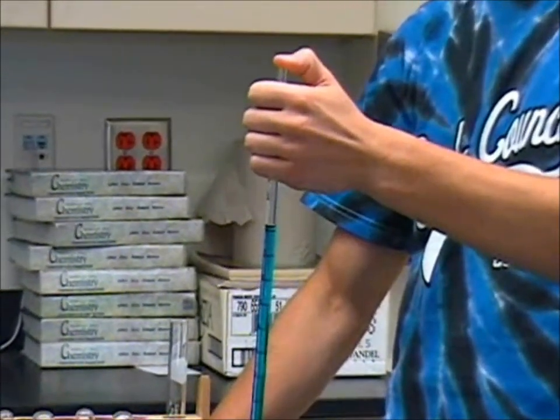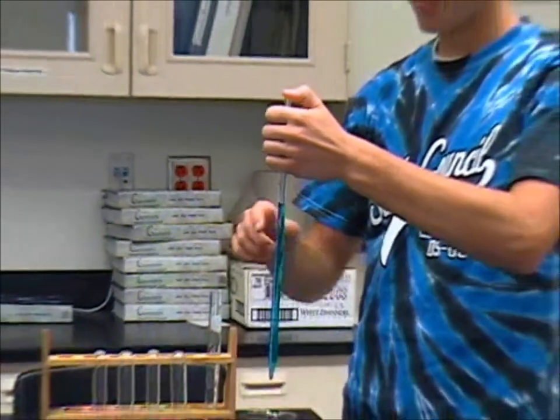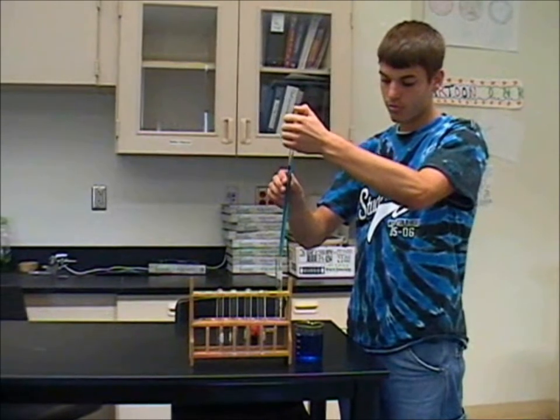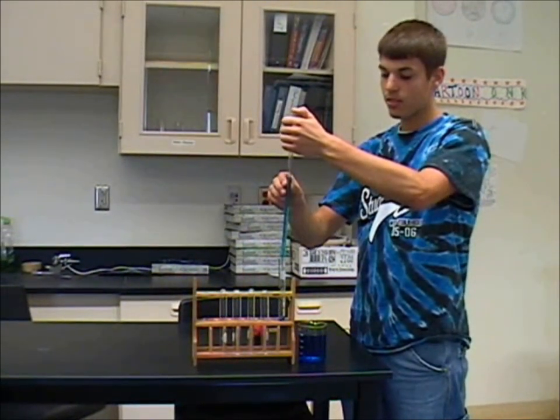Keep your thumb tight on top of the pipette and transfer to the test tube. Let go of the top and release the solution into the tube.